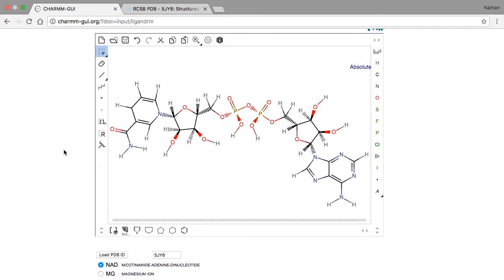It's important to note that the structure that LigandReader uses is not always exactly the same as the structure in the PDB file. Rather, the structure used by LigandReader corresponds to the entry for that ligand in RCSB.